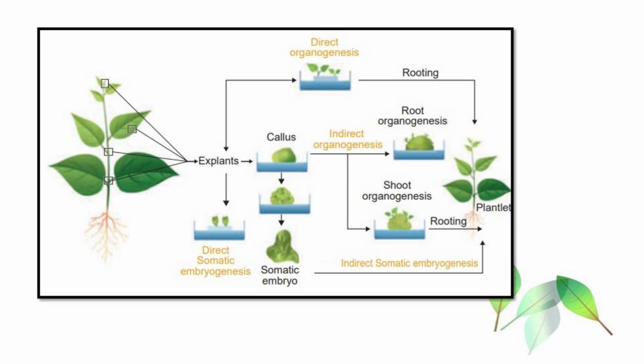From the explant, shoots or roots directly emerge, which means this is direct organogenesis.